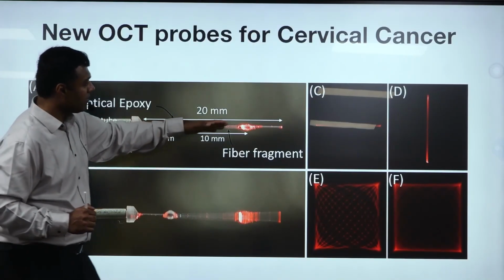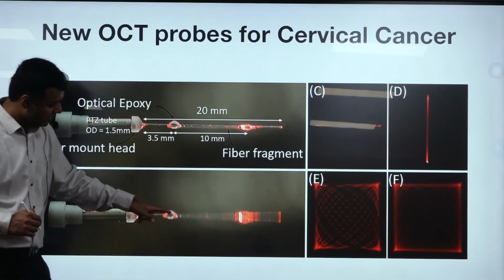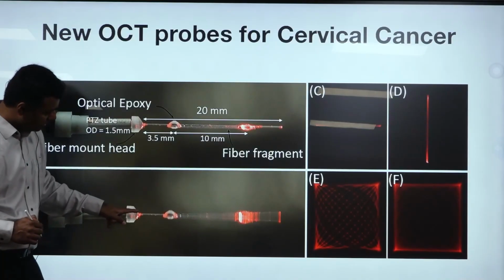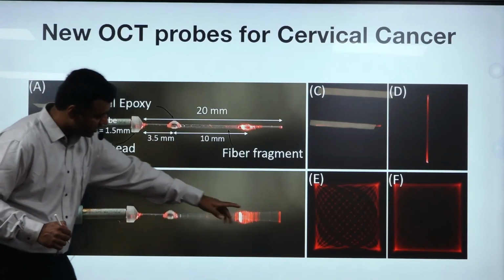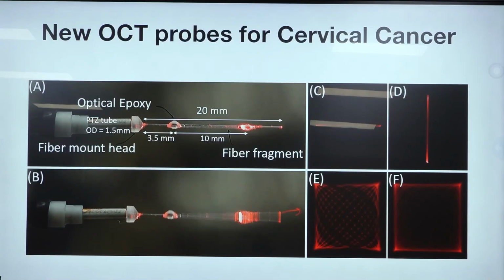So this light comes out at this end, and when it's in resonance, you can see it looks a bit blurred, right? So it's actually resonant along this axis. Although this side looks almost fixed, when it's in resonance, the light coming out of here has a fairly substantial deflection. When it's in resonance, you can see that.